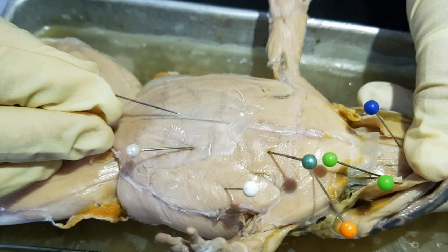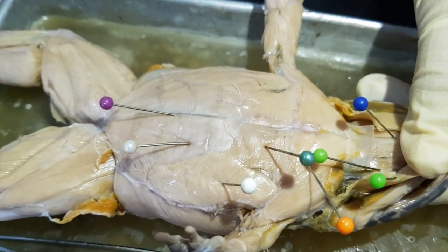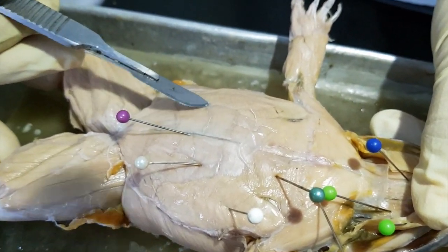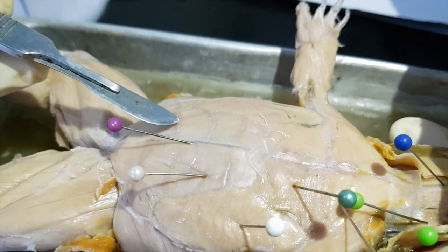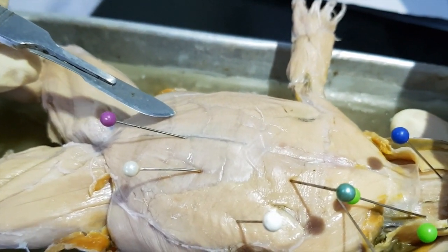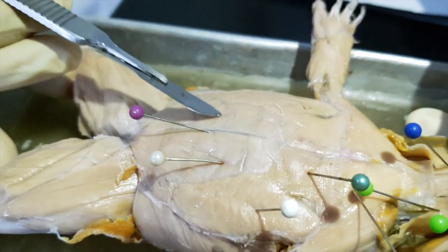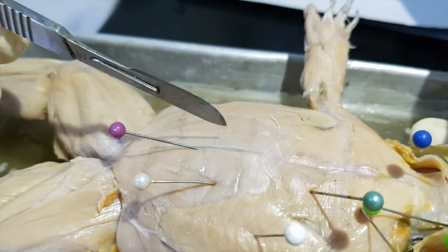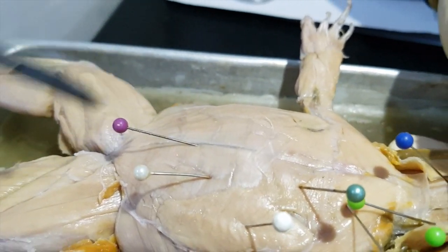Okay, that one is darkly colored because of the ventral abdominal vein that is present. Okay, not in the book, but this is actually another set of structures that separates one from each other. That's the inscriptiones tendineae. Okay, so it shows metamerism, and it separates one from the other. The inscriptiones tendineae and linea alba are the origin and insertion of this group of muscles.